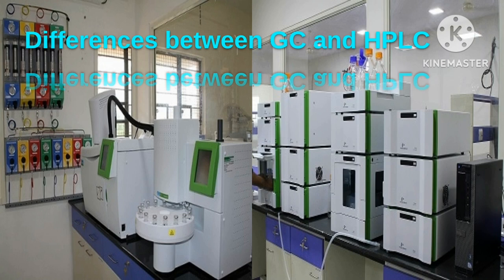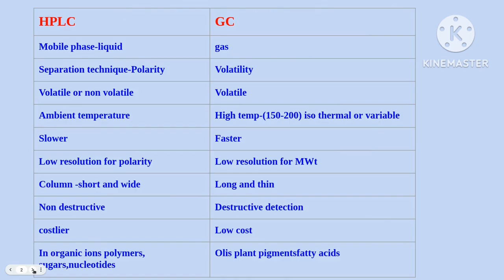Chromatography describes the process of separating and identifying compounds from a mixture of substances. There are several different chromatography methods such as HPLC, GC, thin layer chromatography. In this video, I will discuss the differences between these two techniques, HPLC and GC. In HPLC method, we use liquid mobile phase, whereas in GC we use gas mobile phase.